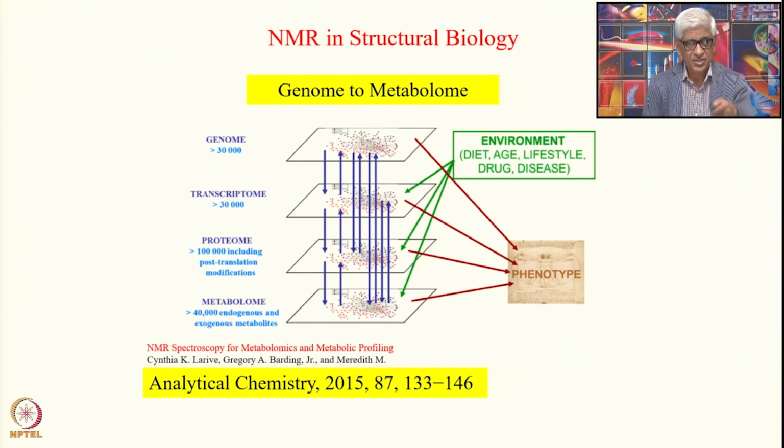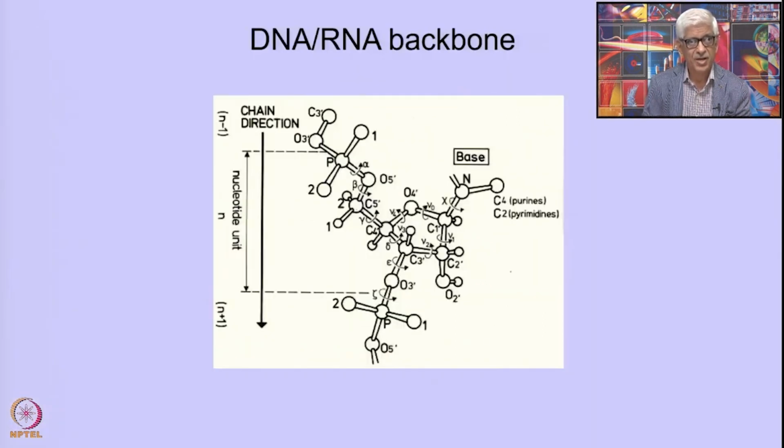There are many challenges, and of course now NMR has come of age to provide solutions to many of these situations. So in order to see how one can apply NMR, we will have to go into the details of the individual molecular structures. Okay, so let us begin with the RNA structure or the DNA structure.